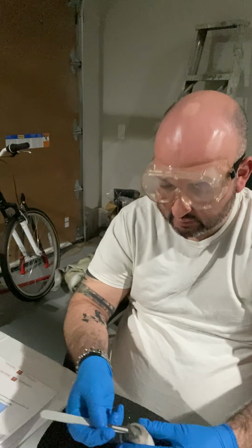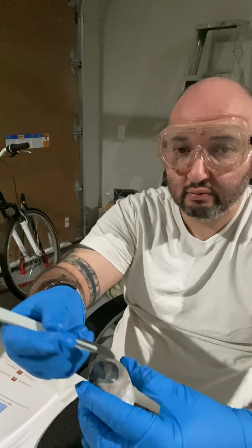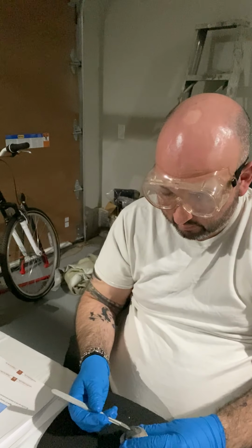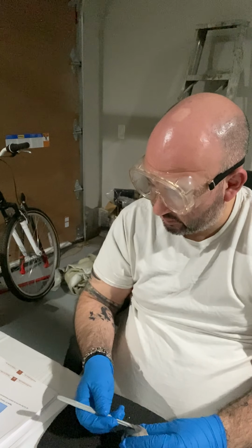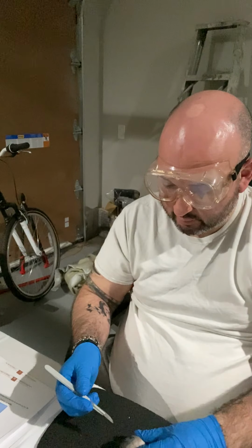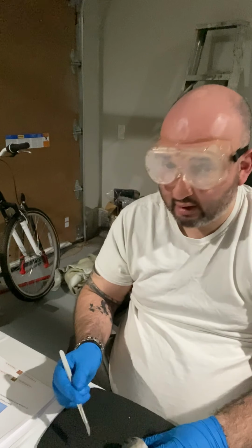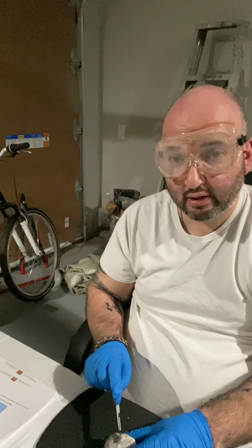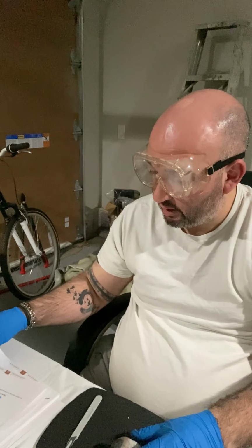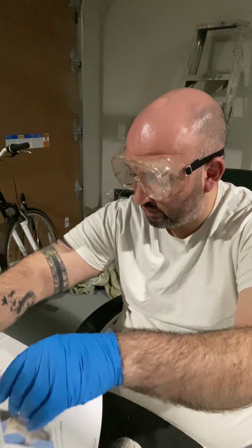So as we can see here, the cornea is very clear, and this is what makes up the front of the eye. Okay, so I'm going to go ahead and cut my eye now this way into an anterior front and a posterior back portion with my scalpel.